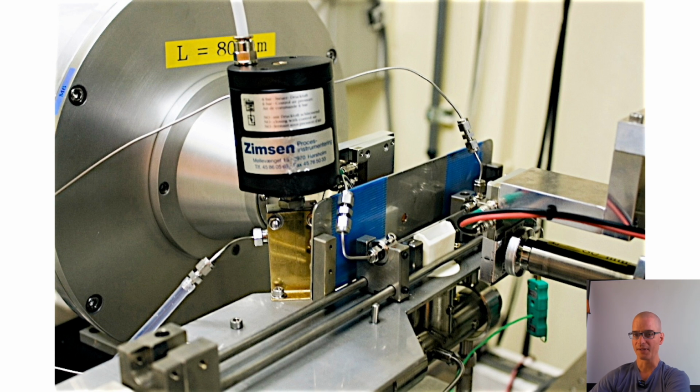The problem was that the data that we got out of that was very difficult to analyze, in that I could not find a classical fitting model that could fit all of the stages of the synthesis. I wanted to be able to fit the initial stages of particle formation as well as the growth of the particles. But none of what I tried actually worked.